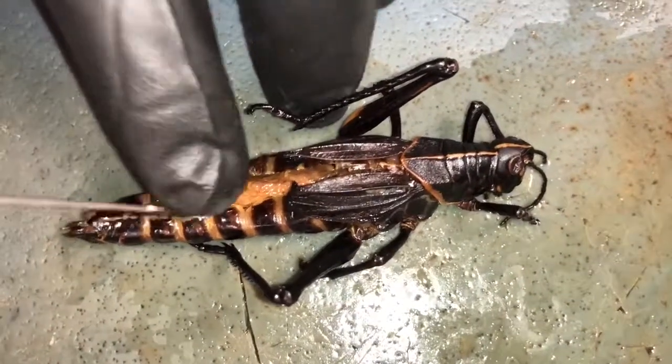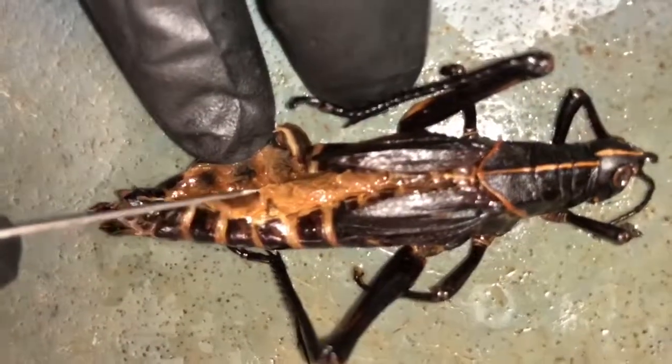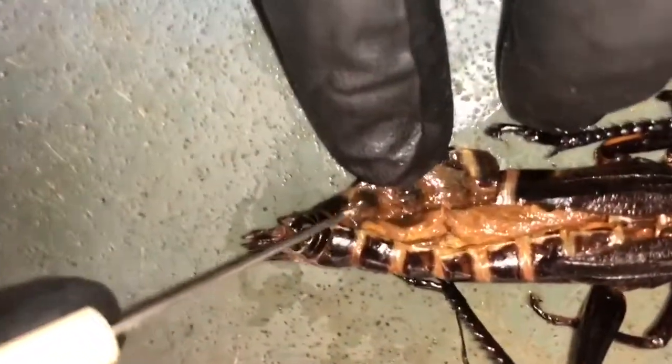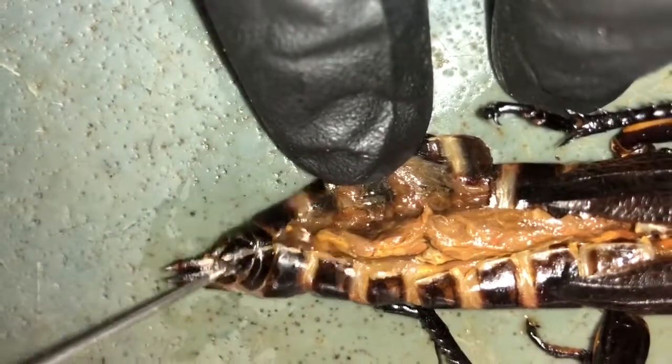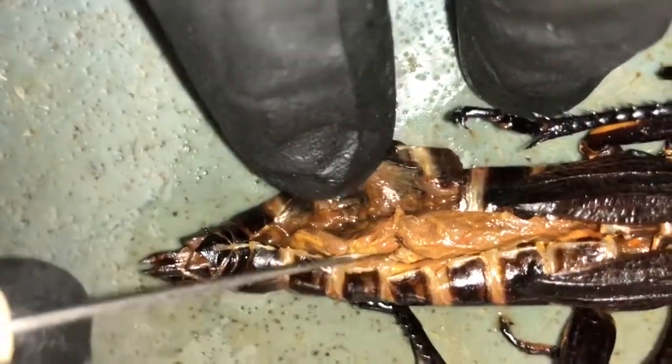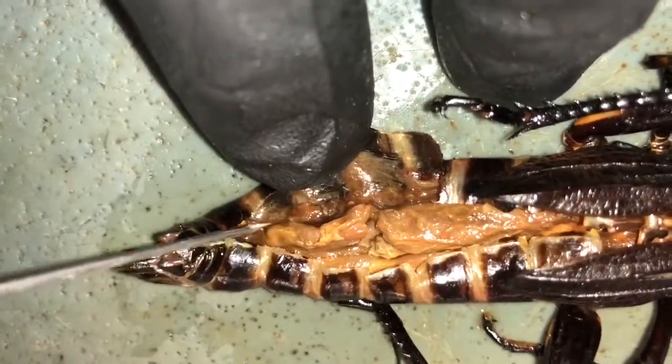Malpighian tubules are going to be right here. That's correct. Let me get a better look, please. Right here. Okay, and how about a trachea? Right here. Not convinced. Right here.